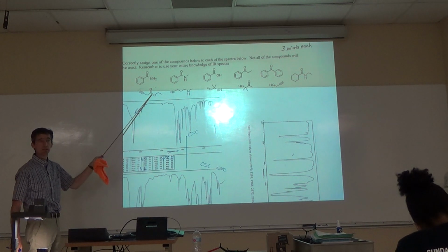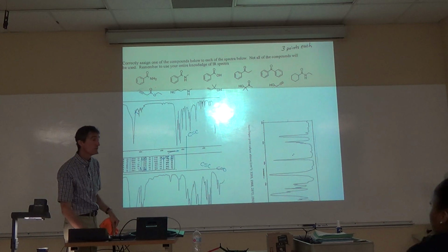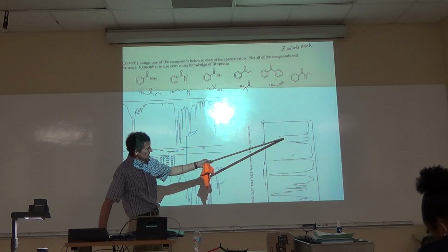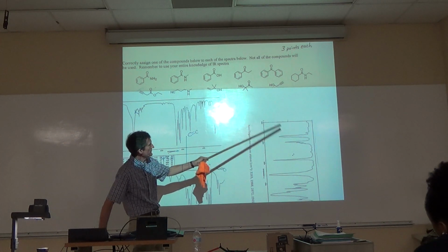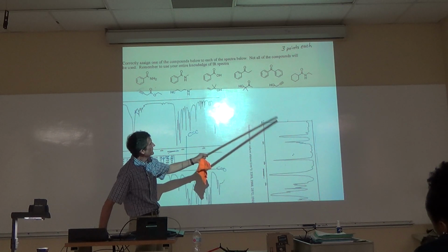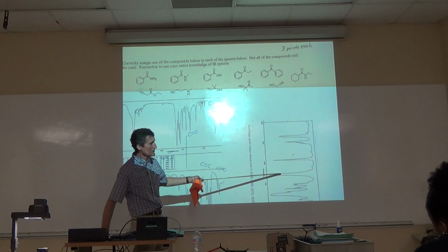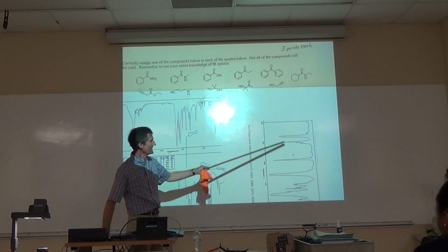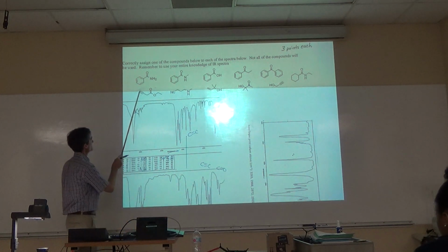Is that at 3200, is it not possible to be an alcohol? Alcohol, yeah. It doesn't look like an alcohol peak. So what do you think it is? If it's an alcohol, the one on the top, the OH with the triple bond? Yeah, but this is clearly a strong carbonyl. There's no carbonyl there. Alright, so I'm thinking it's not an OH, because if it was, there's no choice. So it must be the sp CH.